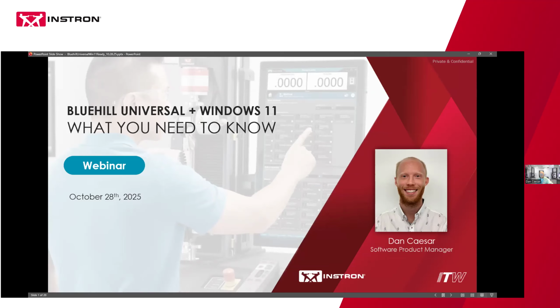So I manage Bluehill Universal software, Bluehill Central software, Bluehill Automation software, which is our new automation platform. And today we are here to talk about Windows 10 obsolescence, how to get ready for Windows 11.